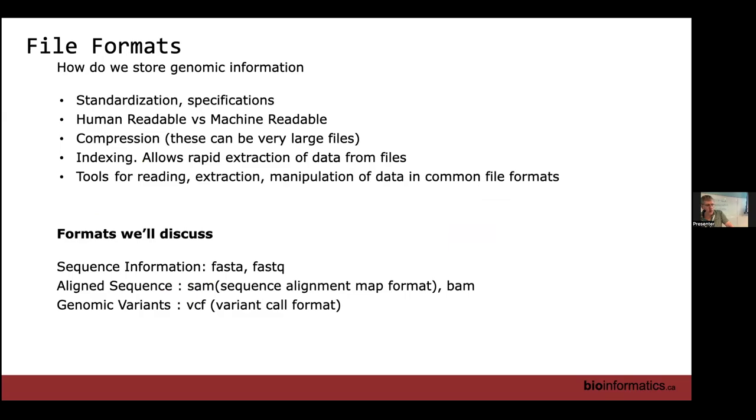Okay, so file formats, how we store genomic information. There's a standardization to how this is done. It allows people to work in a common ground, and allows software to understand what it's going to get when it pulls that information in. Most of these file formats have very detailed specifications about how they should be organized, what information should be in those files, and what all that information means. I put a number of links throughout the lecture, bringing you to the specifications. Some of them are quite long, but we can use them to understand what's in our files. I'm going to talk about the basics, what we see in most of them.